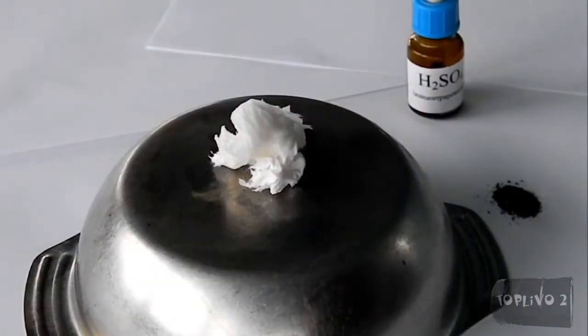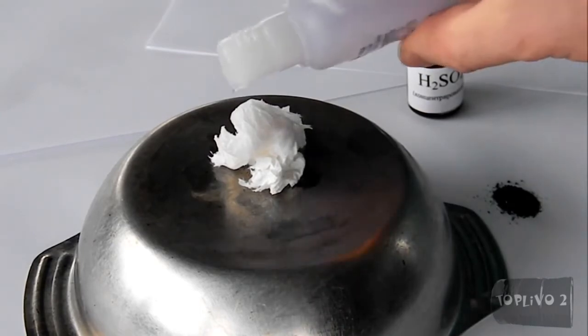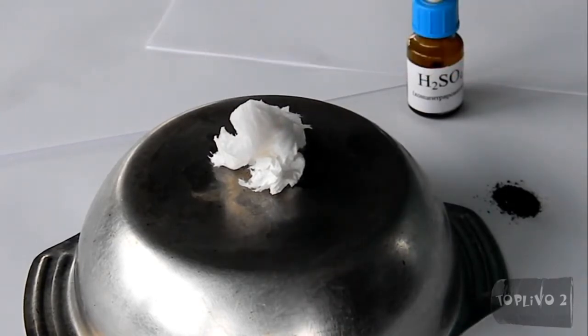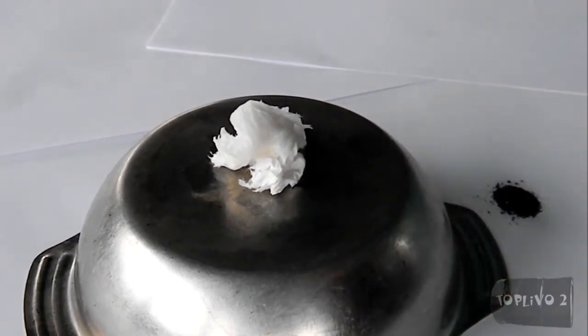Now the third reaction. I moistened a piece of cloth with acetone to make it more flammable. Let's put concentrated sulfuric acid into a pipette and then sink it in potassium permanganate to take a few crystals. Prepare a droplet and drip onto the napkin.